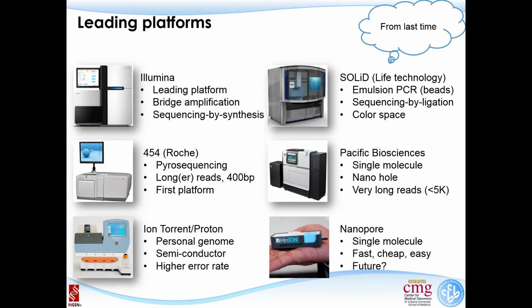Rather, the polymerase will shine the light once the synthesis happens. So even if you have one molecule, the polymerase can still give a light, so you can still detect that. There are some advantages of using single molecule sequencing, and also this technology, I forgot whether I mentioned last time or not.